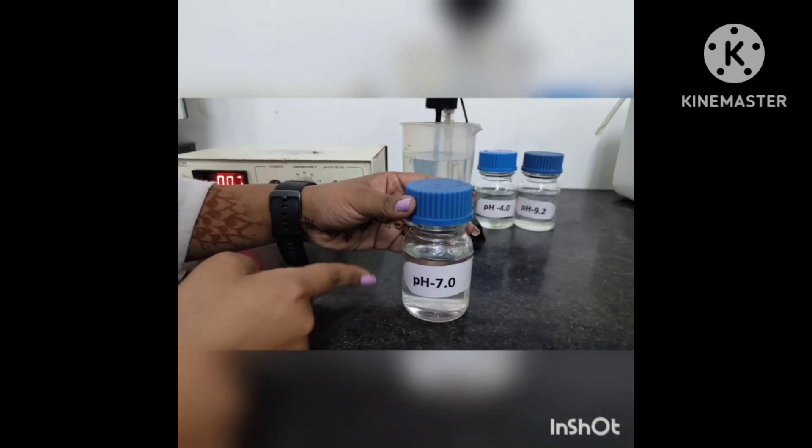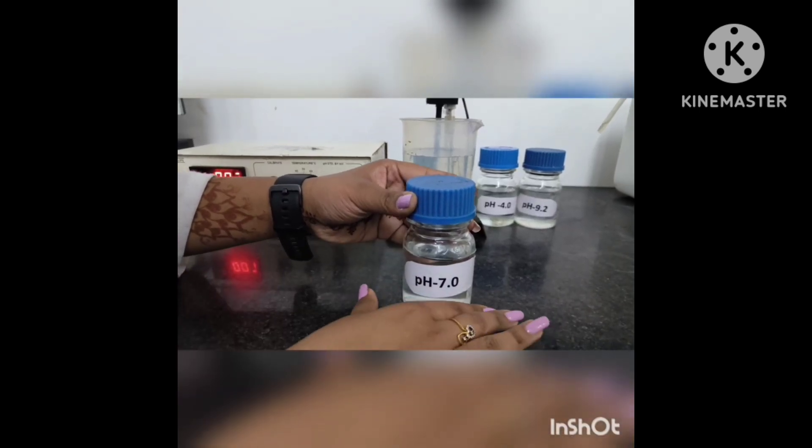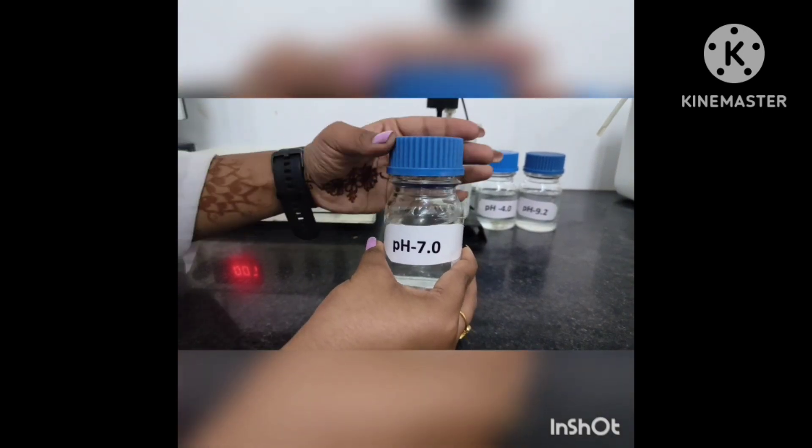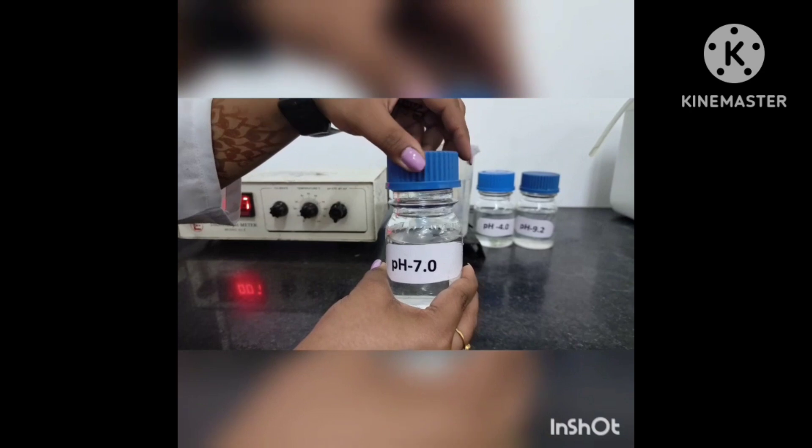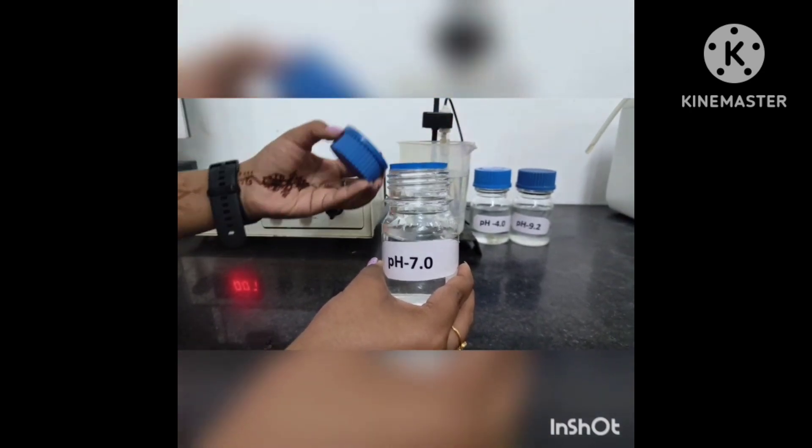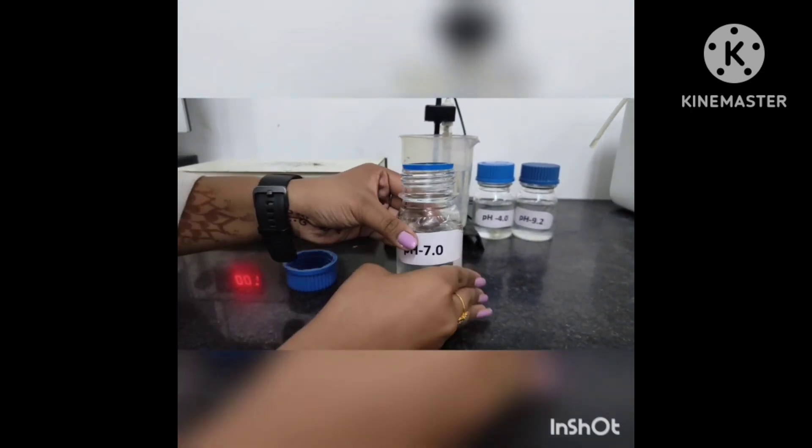Standard pH solution or calibration solution is used for calibration at pH 4, pH 7, and pH 9: pH 4 for acidic, pH 7 for neutral, and pH 9 for basic solutions.